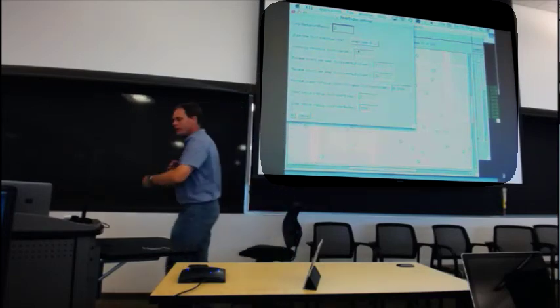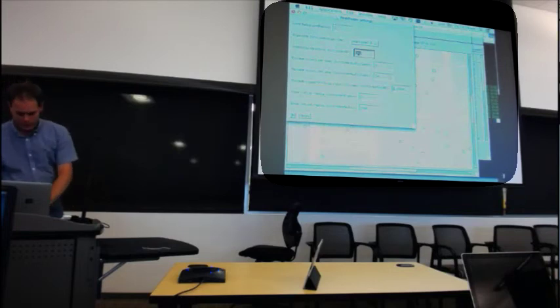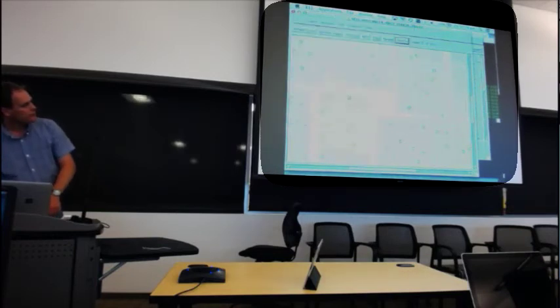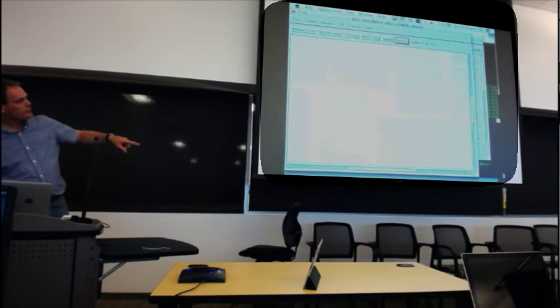You can say, okay, let's make sure that everything's over 250 ADU with 2 pixels up to 20 pixels with a signal to noise ratio of, let's say, 6. It goes away and thinks for a minute, and the graphics are a bit slow to update, but then it'll apply those peak finding criteria, and you can say, is it better or is it worse?